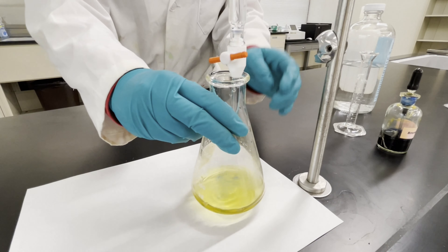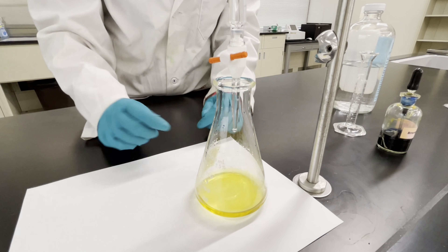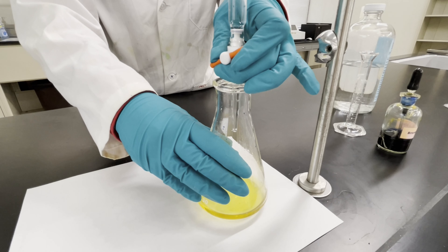As you can see, some blue starts to form, but as you swirl it, it disappears. This means we're getting closer to our end point, but we're not quite there yet. Now you want to slow down and add drops more slowly.